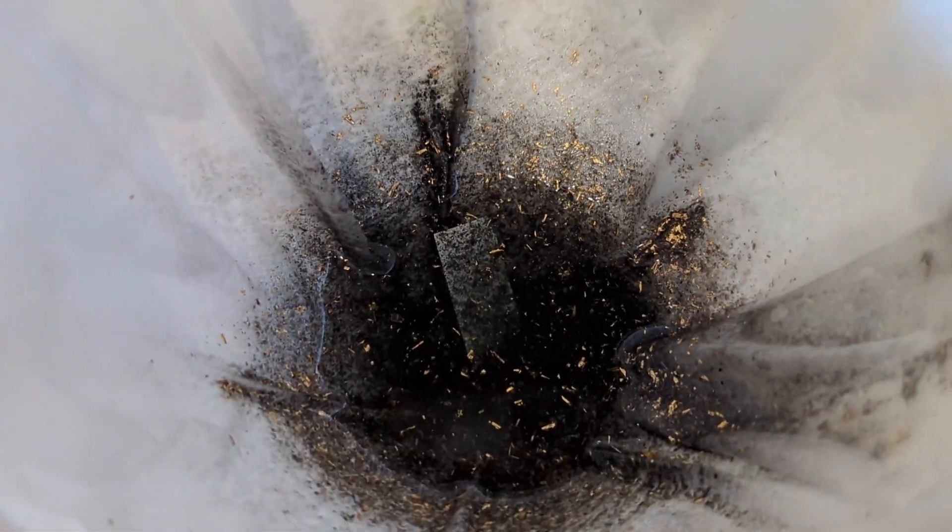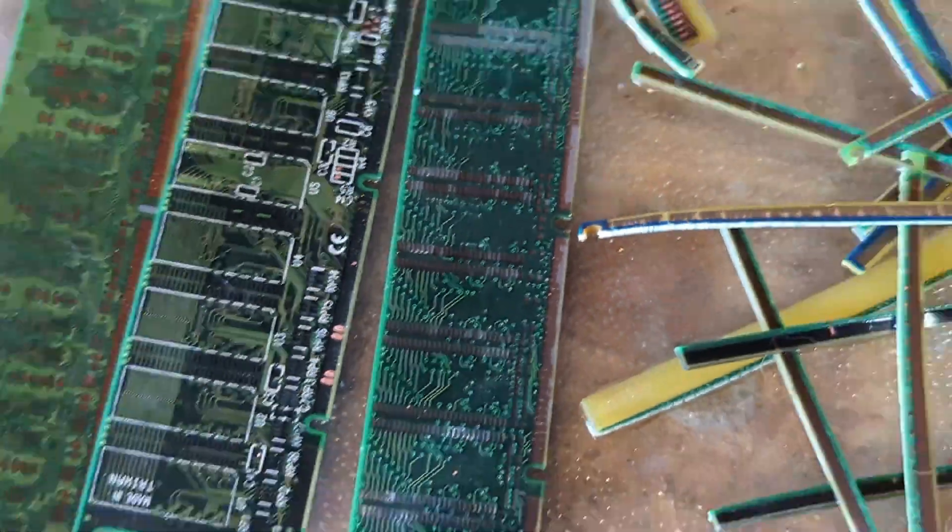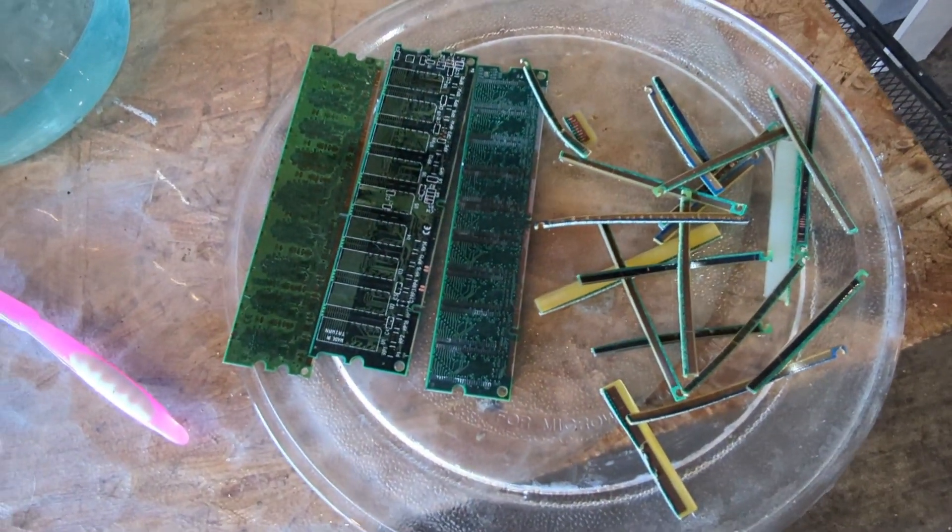Beforehand we could clean this up with some hot hydrochloric acid or some dilute nitric acid to get rid of all those base metals before we take the gold into aqua regia, but I don't see a need for it. So we'll go ahead and take these gold foils to aqua regia and discard these pieces of PCB.